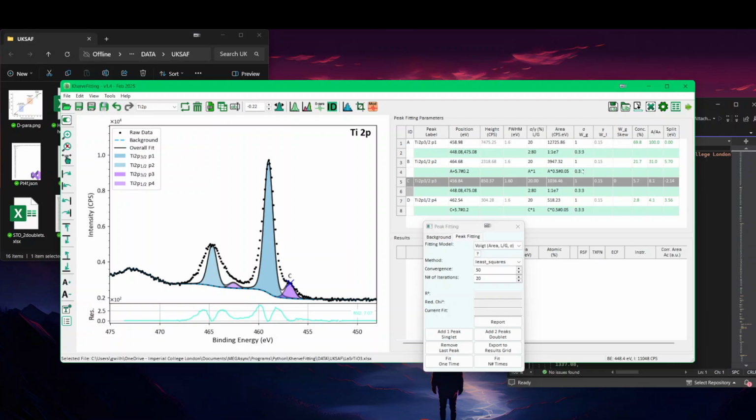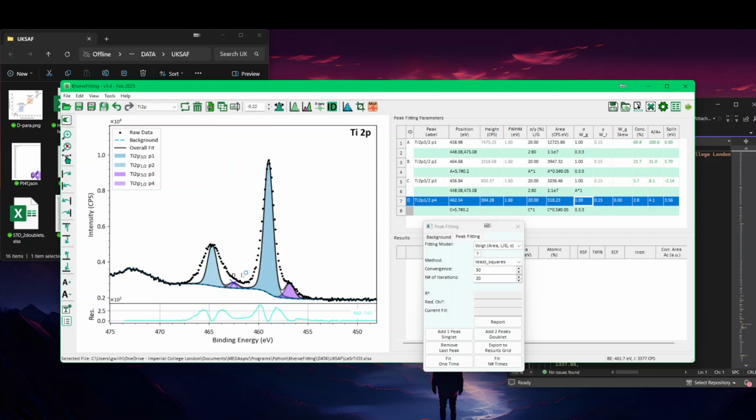But as you can see here, pic C should be in function of A, because this width should be the same as that. So let me do that. If I type A, then it will know that C needs to be A times 1. And I can do the same for pic D. That should be in function of B. So B, and then that becomes in function of this pic here.